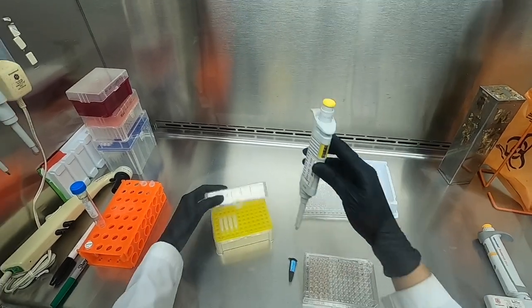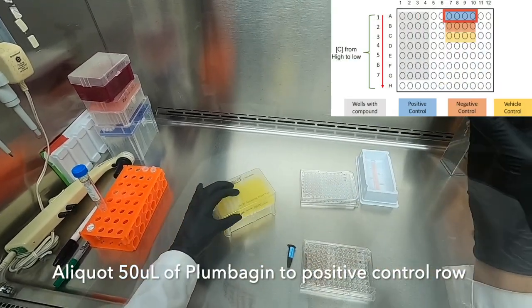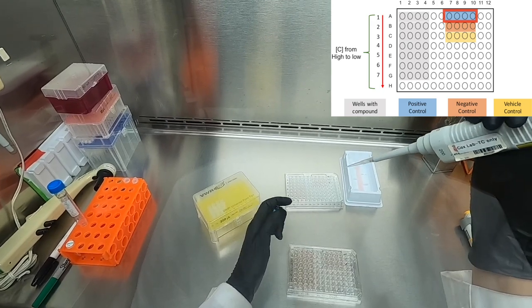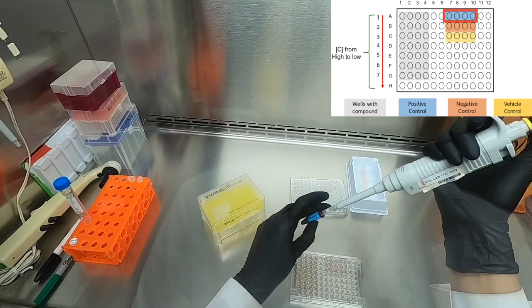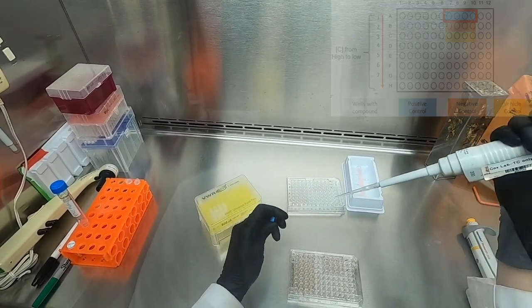Now we will begin allocating our three control groups. First, we will start with our positive control plumbagin, adding it as shown in the diagram.